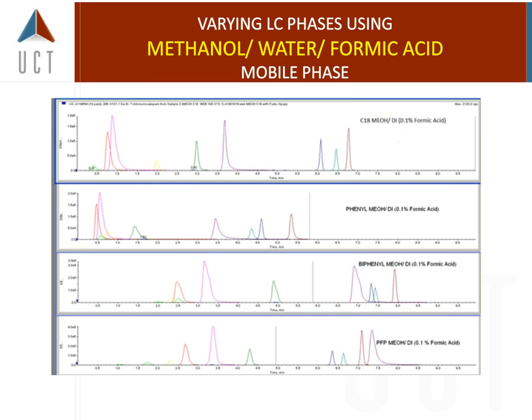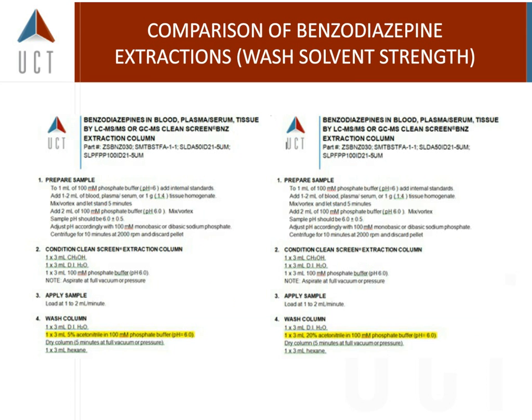This next slide is just the exact same experiment we did prior, and it shows you the difference in just changing from acetonitrile to methanol. Again, solvent: how strong is that solvent? How does it wash it off the column? How early does it elute it off that LC column? If methanol is our polar solvent and it's used as our wash solvent, it may wash some of these polar compounds off. So be careful that you're not washing things off your column if your wash is too strong. And you can use your LC to measure that, because by looking at the retention times, you can categorize your compounds as being more polar or less polar.